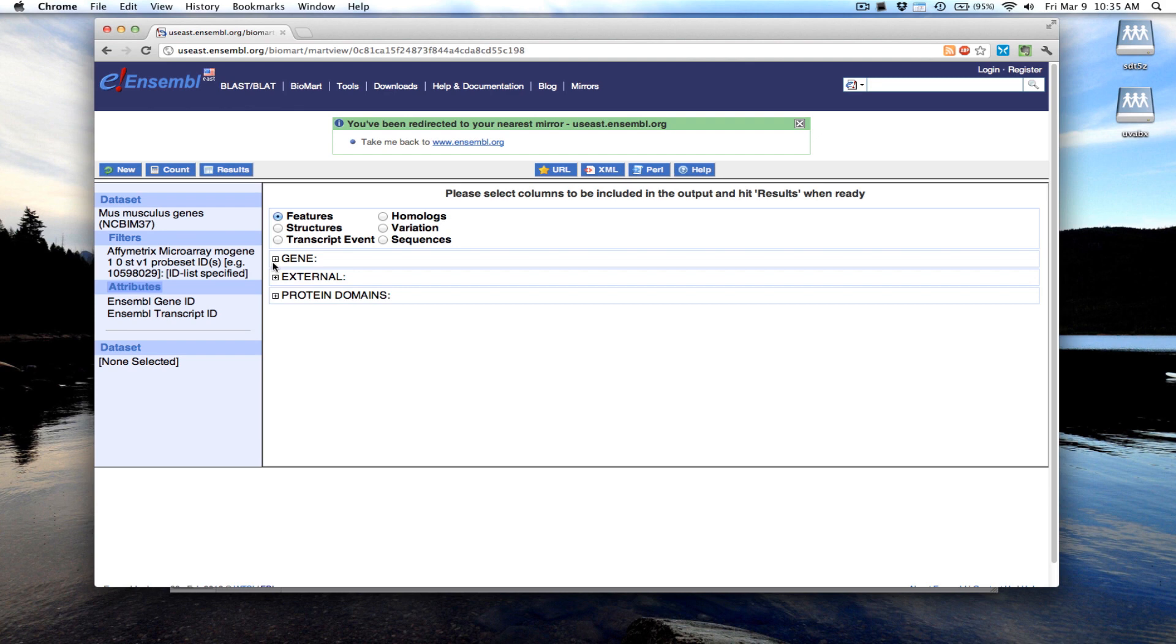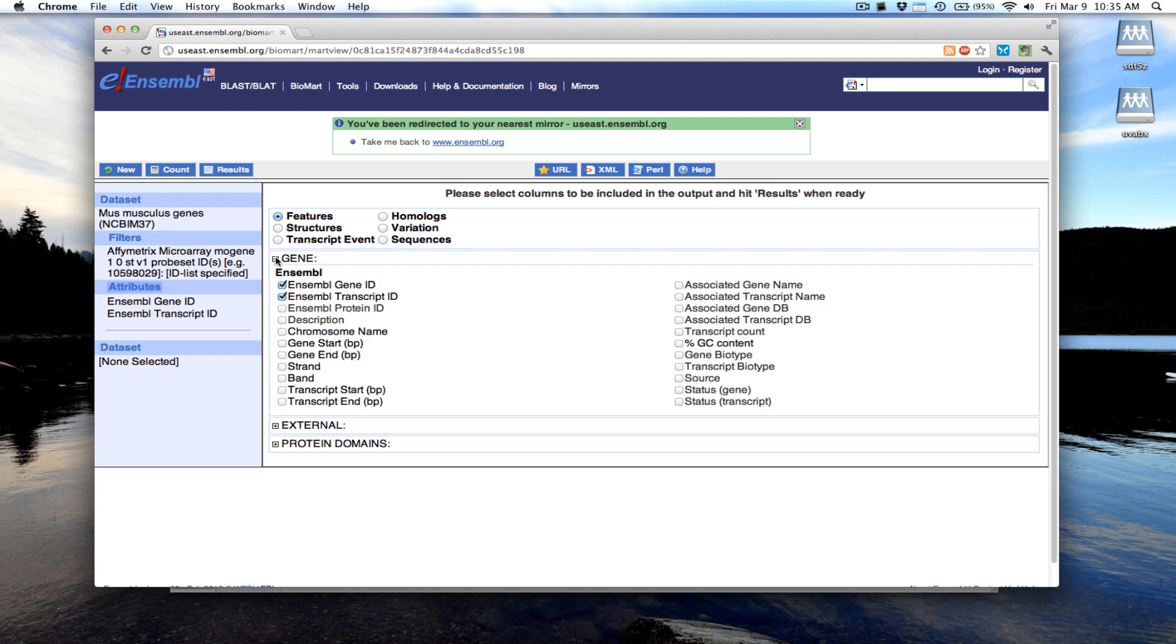If we come over here, click down the gene, by default it selects the Ensemble Gene ID and Transcript ID. I might not care about the Transcript ID.